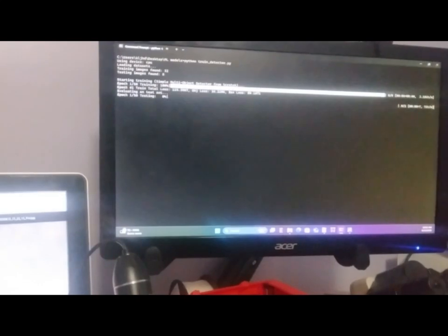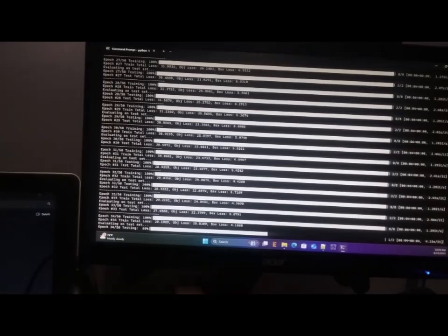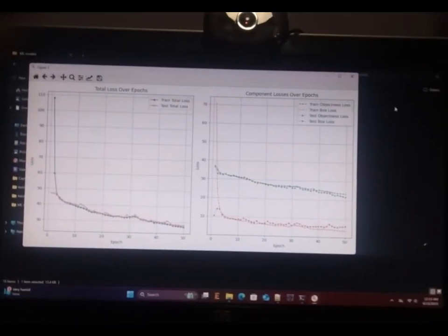I first began training the model, and this is somewhat a slow process, but it has to run for accuracy. And basically, the model is almost done. Then once the training is done, I'm able to plot the loss. So this trained model will be considered a good fit.